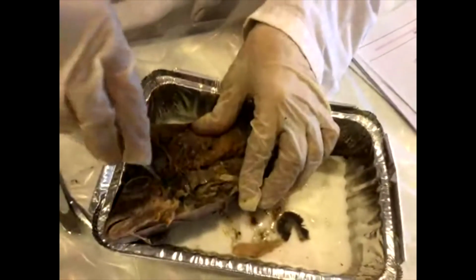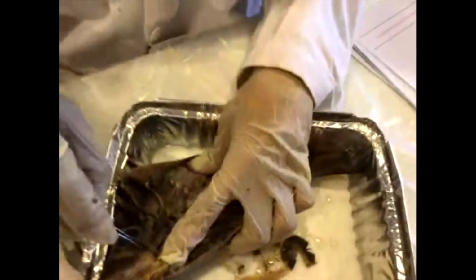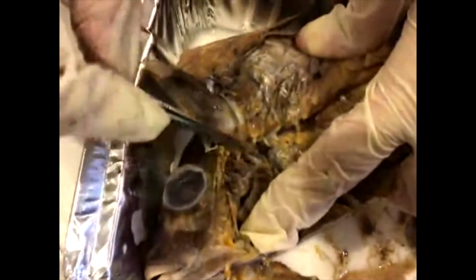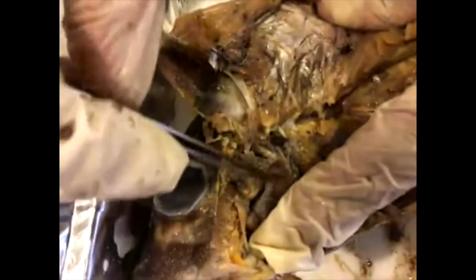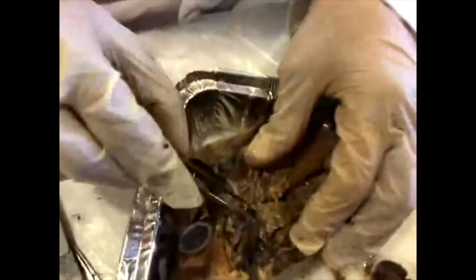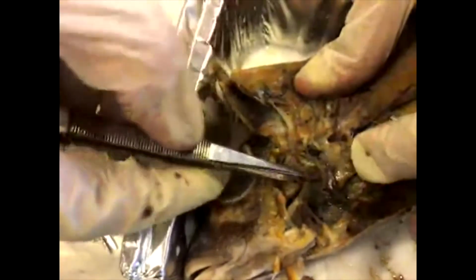Okay, I think I see our heart. I'm going to get you to zoom in on it before I try and extract it, just in case I have a problem. So our heart is right in here, this organ kind of nestled into the gills. And this is all bone around here, quite hard, and quite hard around here. And then it's quite tough, so the flesh or the muscle around it is really strong. And one of the reasons why is because our heart is a muscle, and so is the fish's.